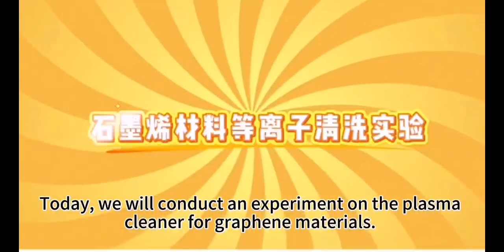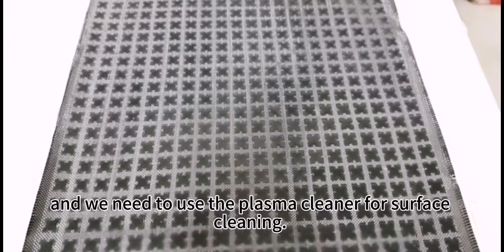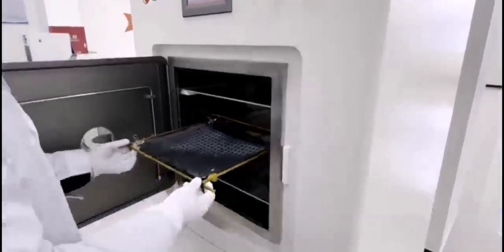Today, we will conduct an experiment on the plasma cleaner for graphene materials. This is a graphene material with trace impurities and residual contaminants attached, and we need to use the plasma cleaner for surface cleaning. First, we spread the original graphene material on a special sample carrier.